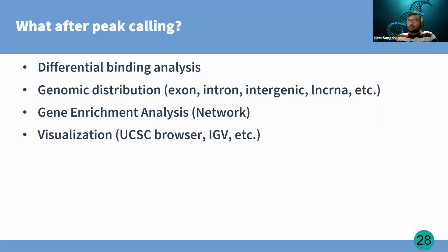So yeah, after we get the peak calling, what's next, right? So after peak calling, we'll do the differential binding analysis. We could do it. I don't think we will be doing it for this NGS series, but there is an option to do differential binding analysis that shows us which specific set of protein-DNA interactions are differential compared to the control group, right?